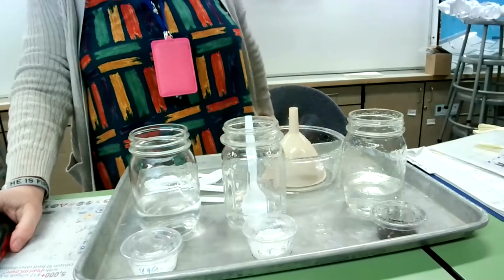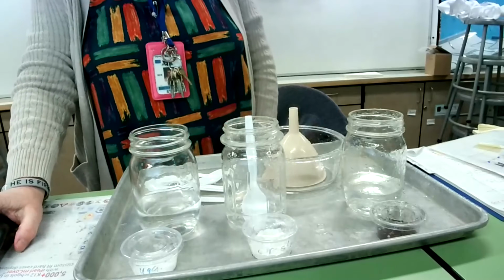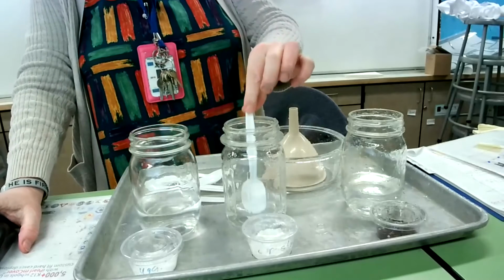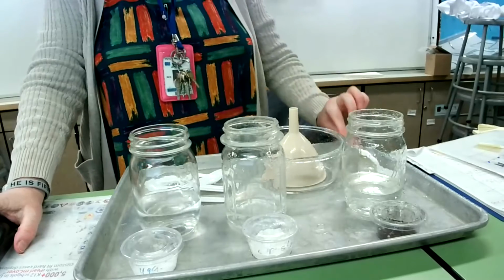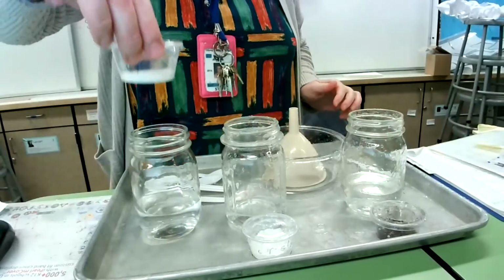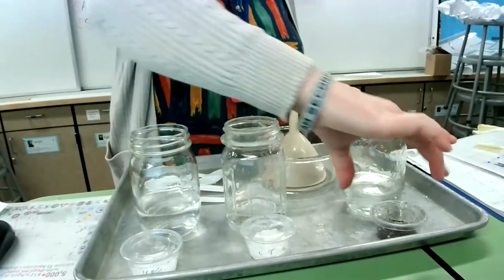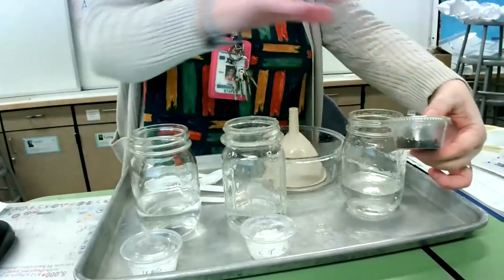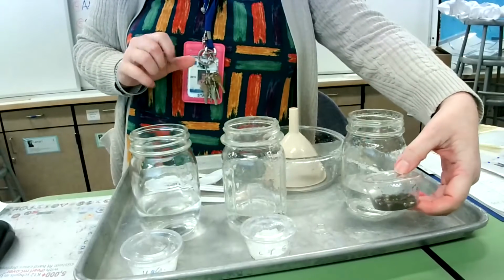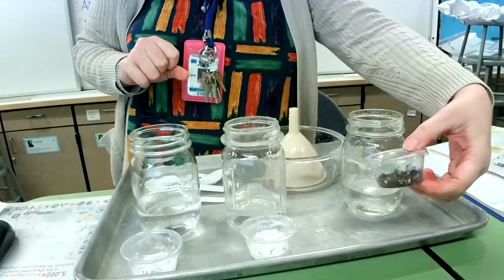Okay, this is Mrs. Kuiper, and I am going to be performing the investigation lab for lesson 4.5, solubility. What we're going to do is we're going to have three substances. We have sugar, cornstarch, and soil. Now, it says sand in our lab, but what I got is a mixture.